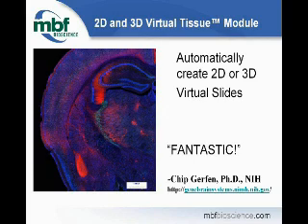Some of you are probably wondering, what do I do with all this image data? How do I store it? How do I keep track of it? Keep an eye on a product we're coming out with called BioLucida. I think it is an image server, and it's where the virtual slides, the virtual tissue that you make, is meant to be stored and accessed via BioLucida.